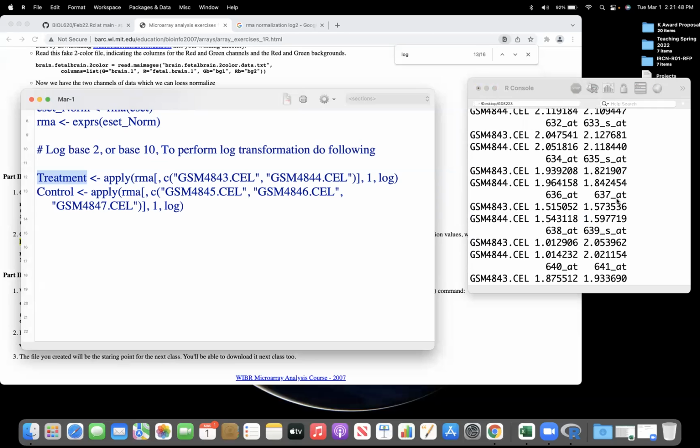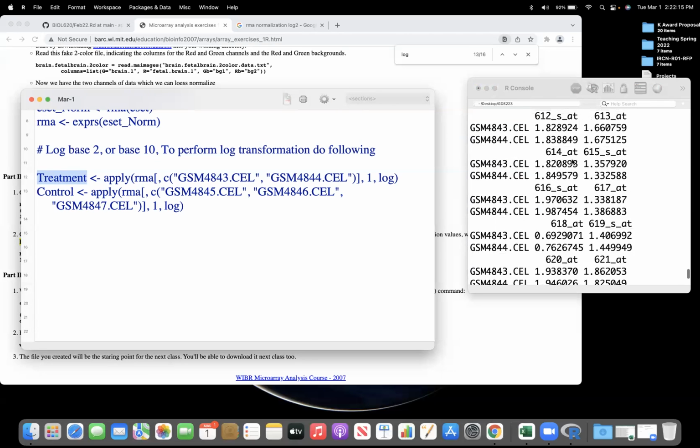So did you hear what change has occurred here? What is the change which we have done here? Yeah, we have scaled down. There are two things which have happened here. First is we did a log transformation, right? So previously you had values like 10, 8, 9. Now it's like 1. You did a double log transformation. But there is also a second change which has happened to this data frame.